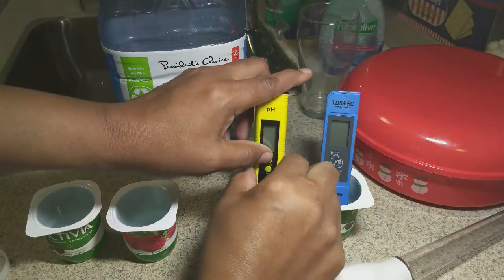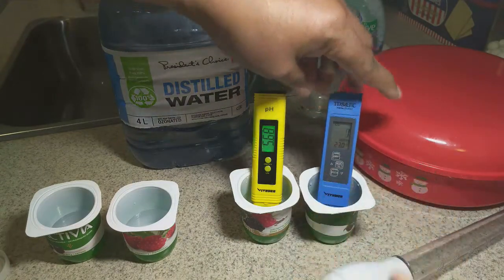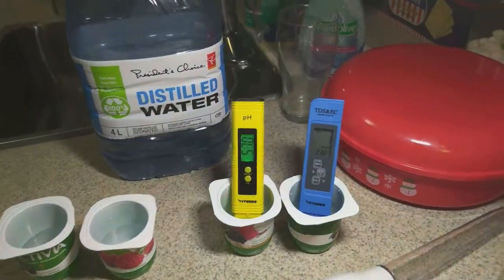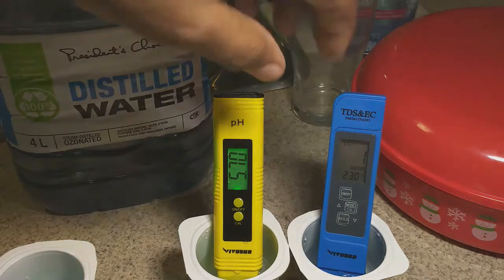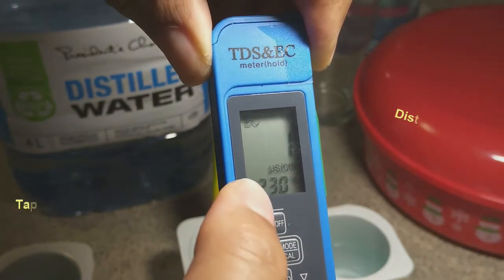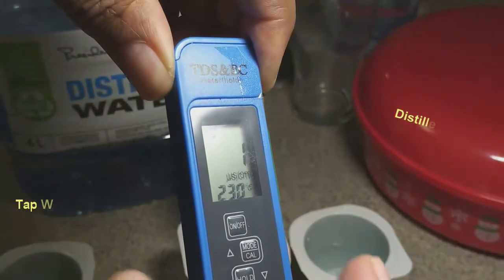Let me switch them on first — that's the pH, and that's the EC. I'm going to press hold on this one. The pH is going about 5.70 as the max so far. And if I bring this EC meter, it tells me the temperature is 23 degrees in that water.